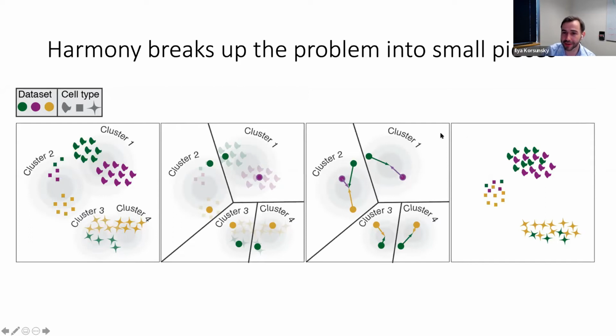Bill asks, what are the assumptions regarding a low-dimensional embedding? Does it have to be linear? Can it be approximate? Yeah, PCA is what we've been mostly using Harmony on, and PCA does have a linear assumption. But when you actually look at the data, the PCs are obviously not well-behaved Gaussian distributions. There are outliers. There are multimodal distributions in the PCs, right? And so I don't know exactly how much we can break these assumptions before Harmony fails. It's a very good question, though. But intuitively, things need to be locally linear for it to work, right? So global linearity is absolutely not a constraint. But as long as you can divide the space into things that are approximately locally linear, then you're good.